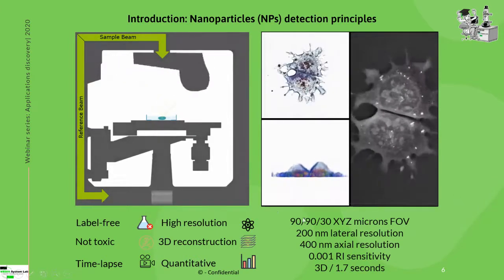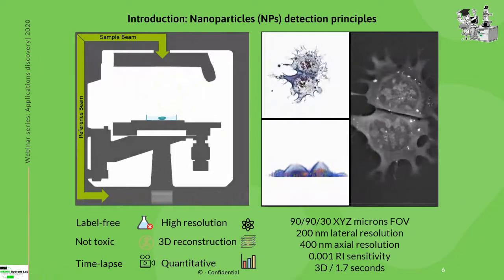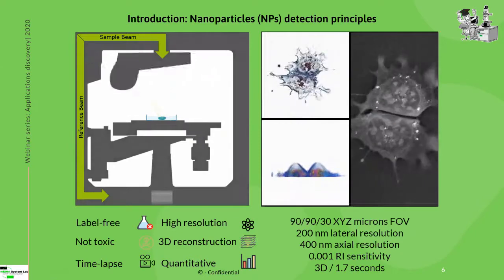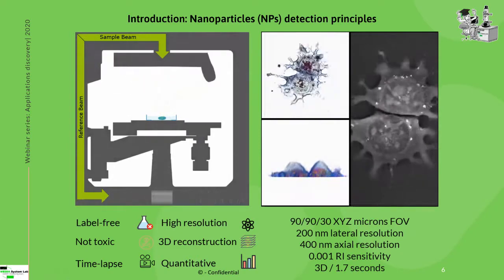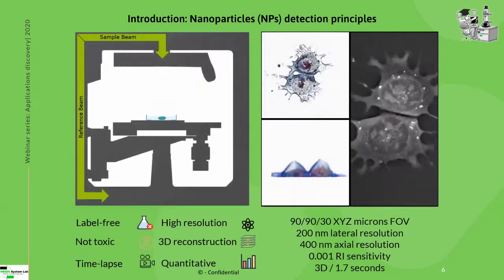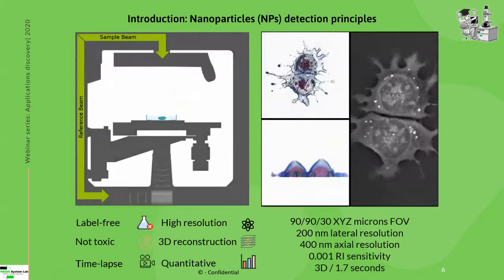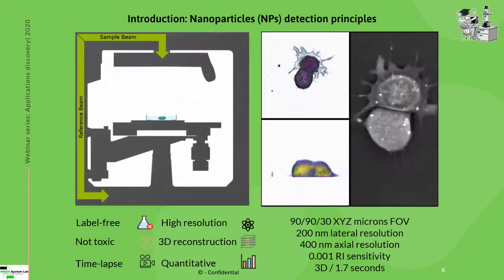The final result has a 90 by 90 by 30 micrometer field of view, 200 nanometers as lateral resolution, 400 nanometers as axial resolution, and 10 to minus 3 as refractive index sensitivity. The acquisition speed is full 3D in 1.7 seconds.